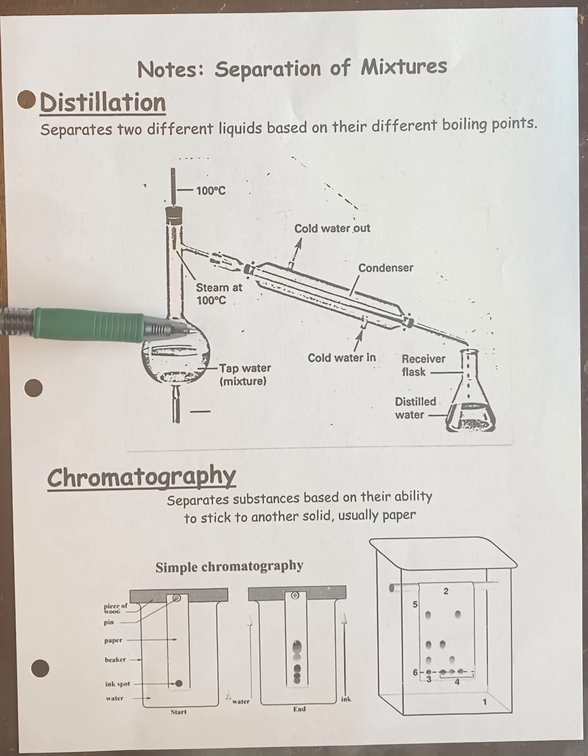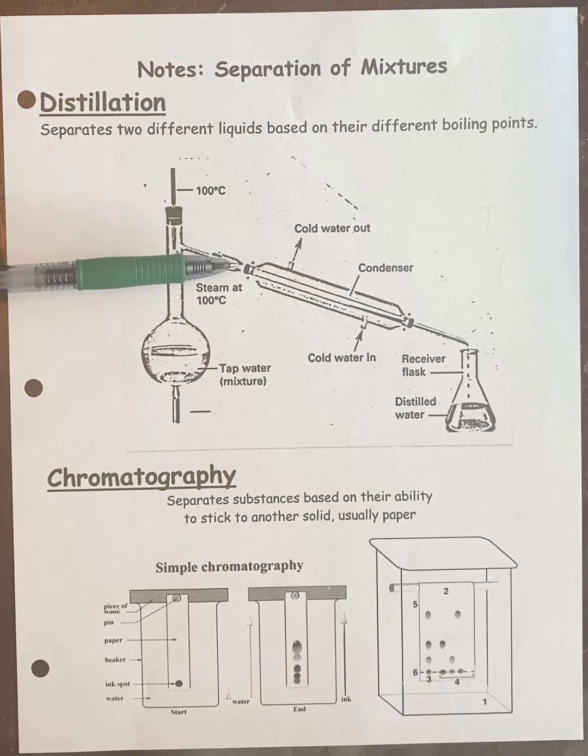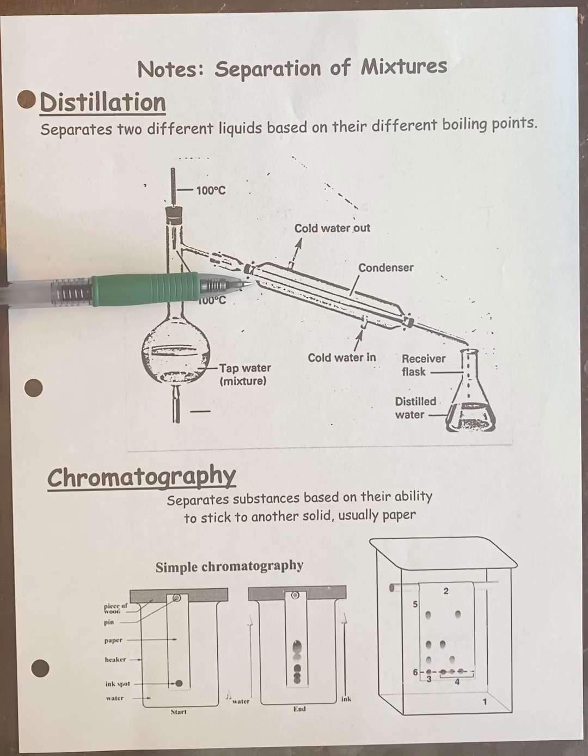Now, once you turn it into a steam, you then put it into this pipe, which is called a condenser. What this condenser does is literally its name. It condenses a gas back into a liquid. And the way it does that is basically the bathroom mirror effect. You know when you take a shower, you see all the fog that collects on the bathroom mirror? The reason is that the steam given off by the shower is in the gas phase, and when those steam molecules touch the glass, it's much colder, it lowers their temperature, and then they condense back into a liquid, and that's where you see all that stuff building up on your mirror. That's essentially what's happening here, but very fast.